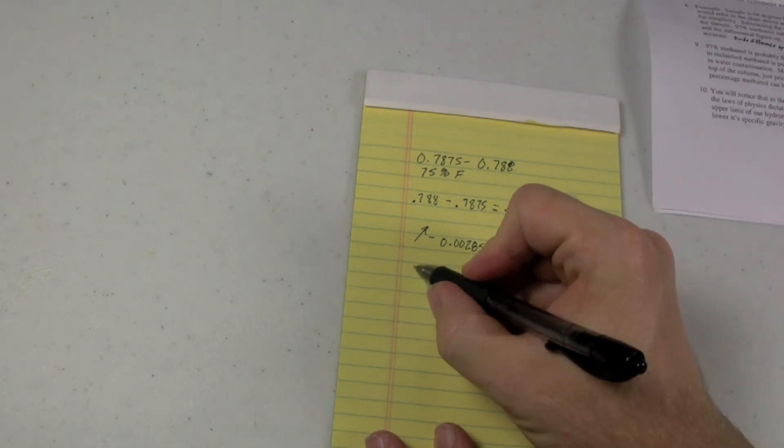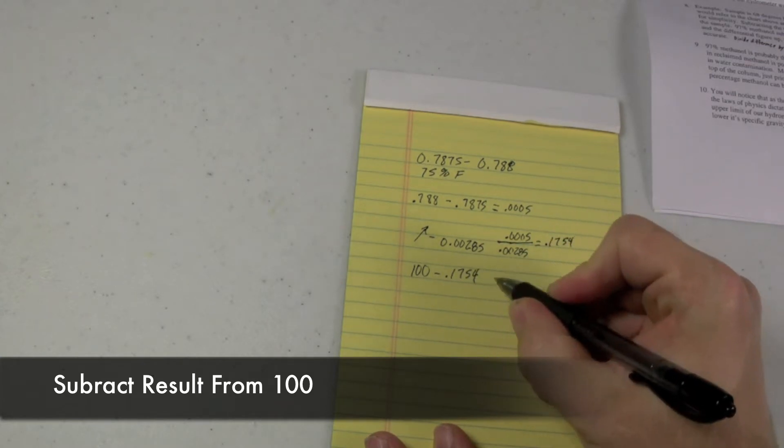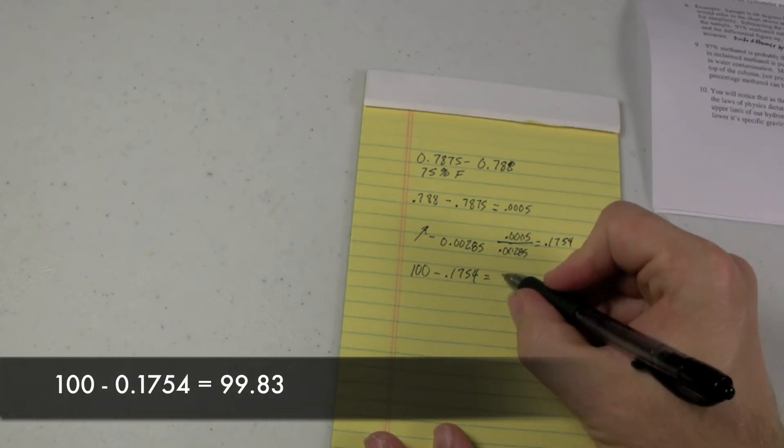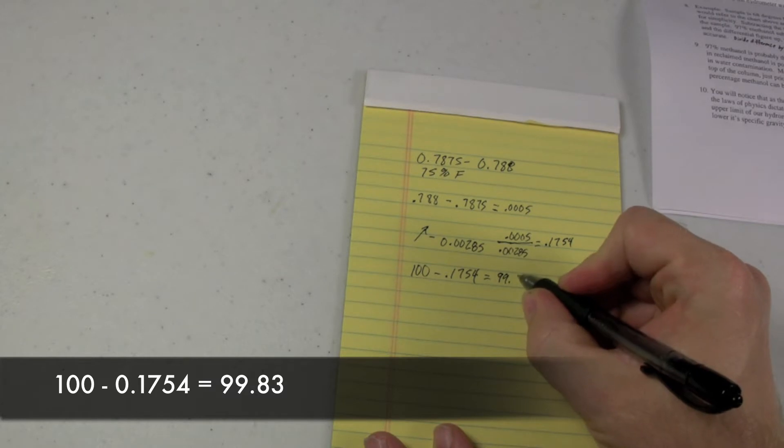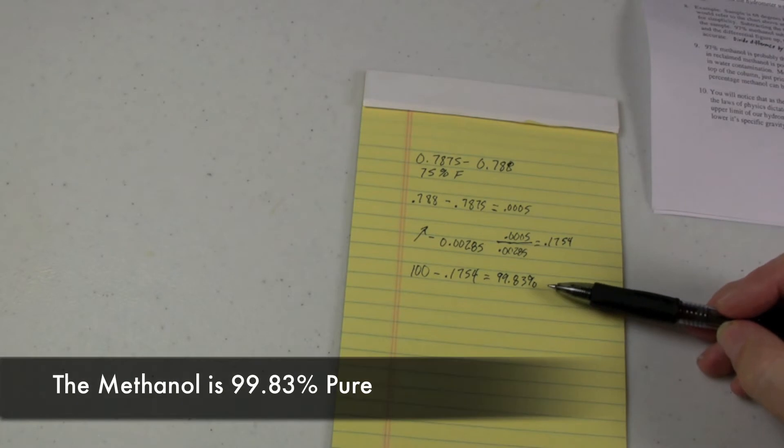We then take 100, and we subtract .1754. That's going to give us 99.83%. So this methanol would be deemed 99.83% pure.